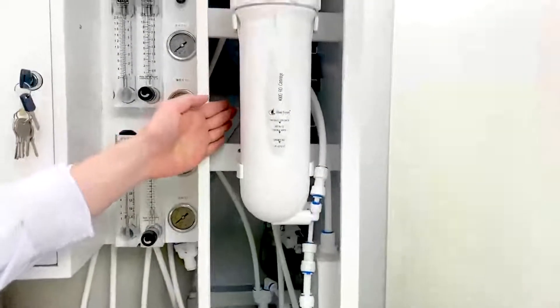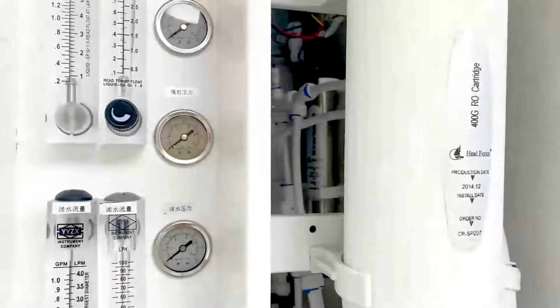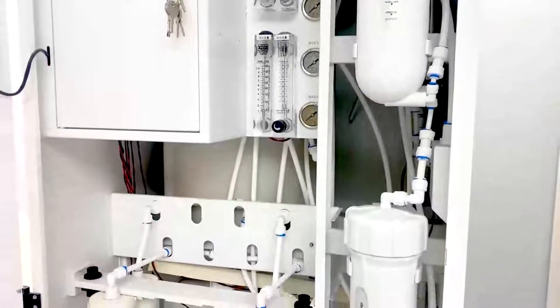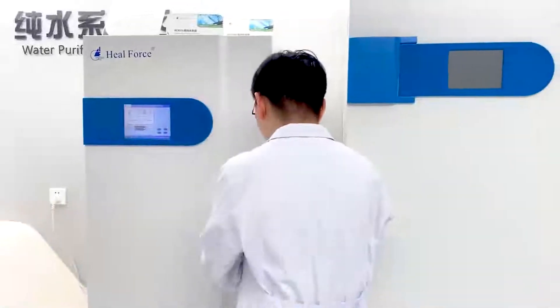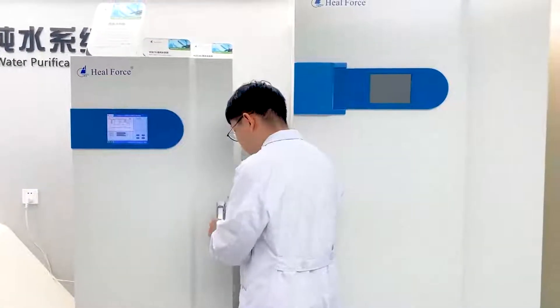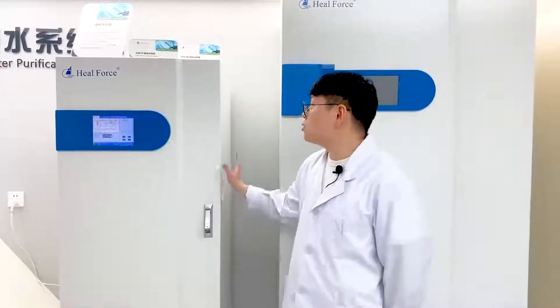We have a UV lamp inside. This is the 60-liter water tank. If you need a large volume of pure water, you can choose this type.